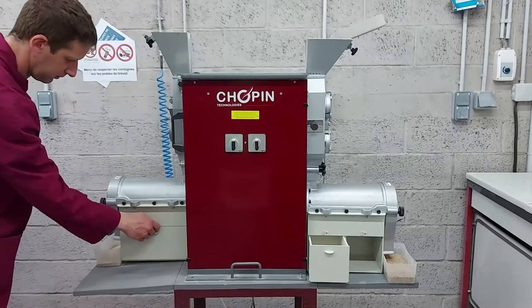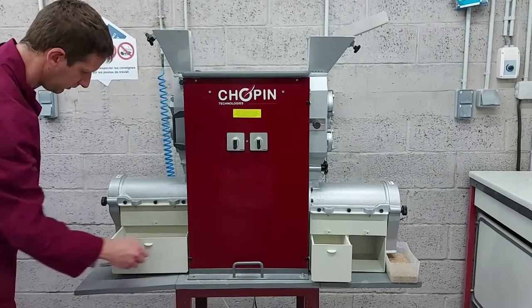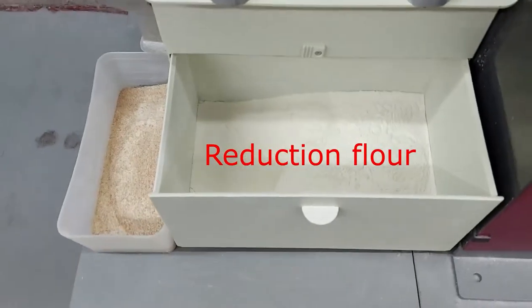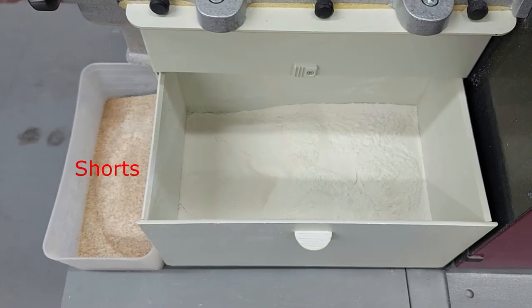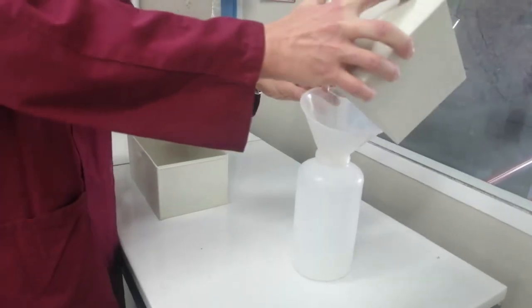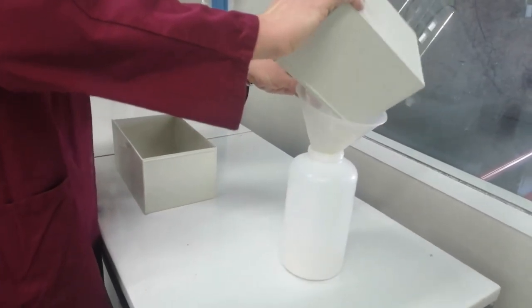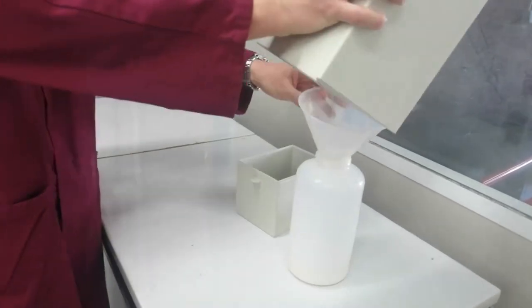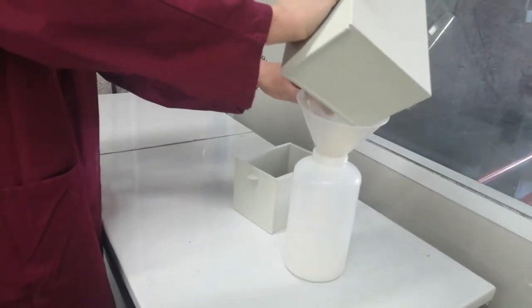You obtain two new products: reduction flour and shorts. The milling is now complete, and all you have to do is combine and homogenize the two obtained flours — breaking and reduction.